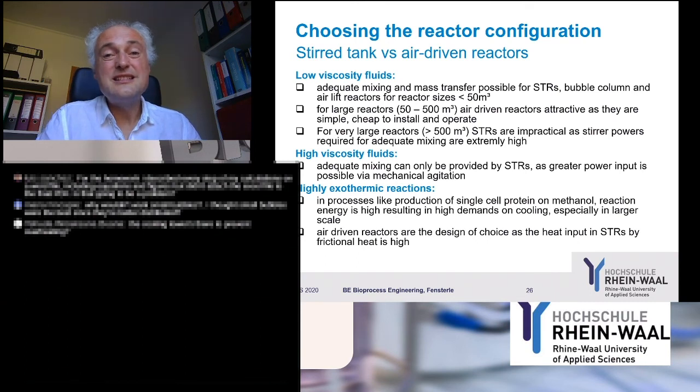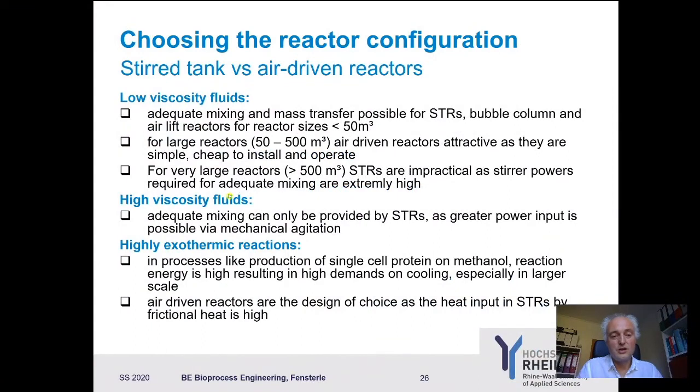And in these large scales, if you have high density, you produce an enormous amount of heat, and you cannot bring that away just by normal cooling. You even need these cooling towers. That's the point. And if we now look back to this point, this is exactly what is depicted here in this part.